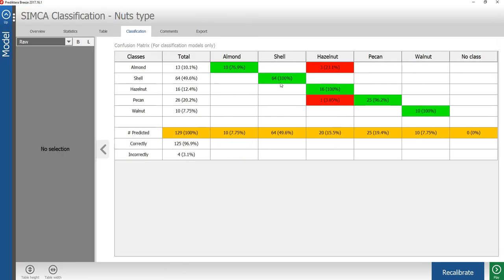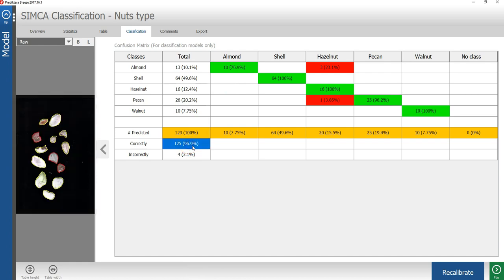In the classification tab, we can now see how all the samples in the training data were classified using the Simca model. We see that in this case, we have 96.9% of the samples in the training data that were correctly classified, which is an improvement over the PLSDA model.